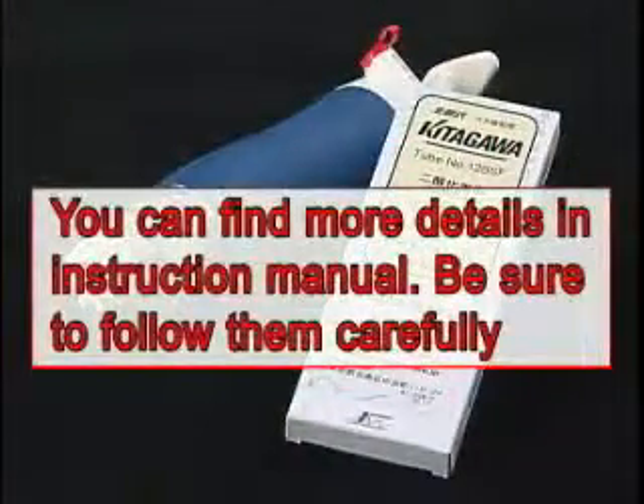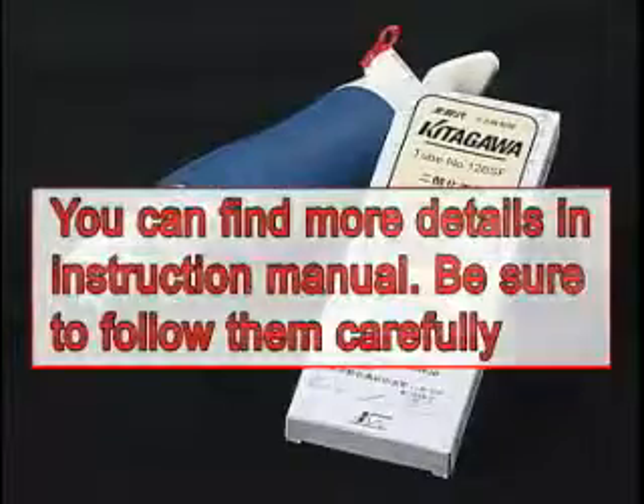Remember, be sure to read the instruction manual for the sampling pump and each detector tube prior to use in order to assure proper operation.